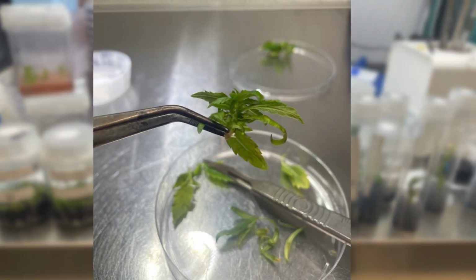So we'll take these explants. Again, an explant is just whatever plant you're working with in a laboratory environment. We wash them in a soap solution, usually for about 20 minutes, but it depends on the crop you are using. This is just to get any debris that may be present off the plant tissue. After this, we wash them in a bleach solution, 10% bleach. Some people use ethanol. You can use silver nitrate. Bleach is the most common thing that you're going to have at home. This is going to kill any pathogens that may be present.